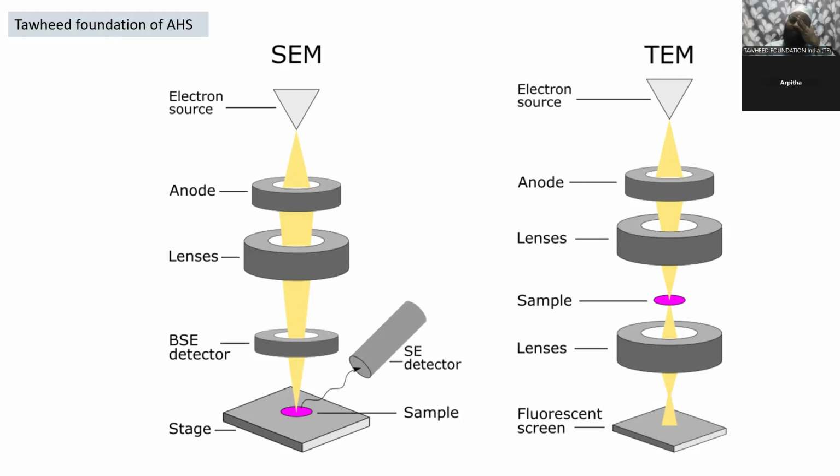So the electron beam coming out of the specimen passes to the objective lens, which has high power and forms the intermediate magnified image. The ocular lenses then produce the final further magnified image, which is connected to the monitor, and the image can be observed there.